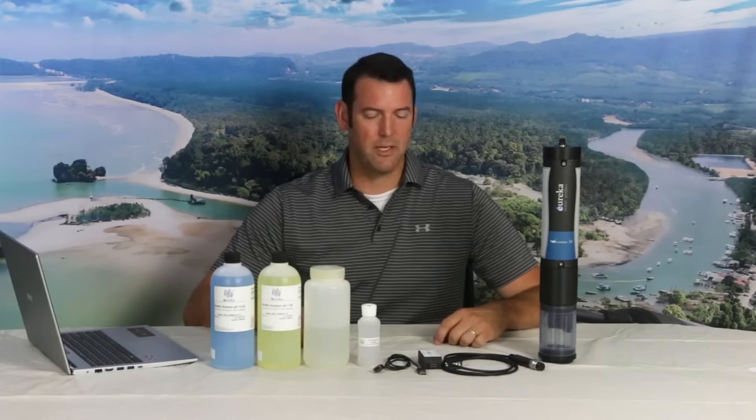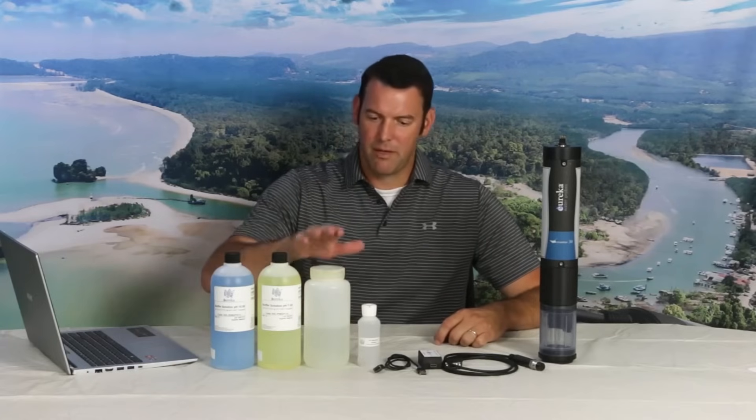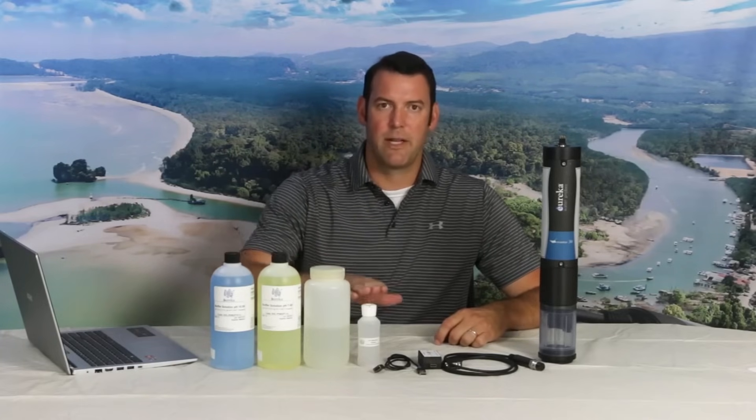Hello everyone. Welcome back to another Eureka Waterprobes instructional video. Today we're going to talk about calibrating your pH sensor. It's pretty simple really. All you need are two of your favorite pH buffer solutions, some DI water, and your reference electrode electrolyte. Let's jump in.